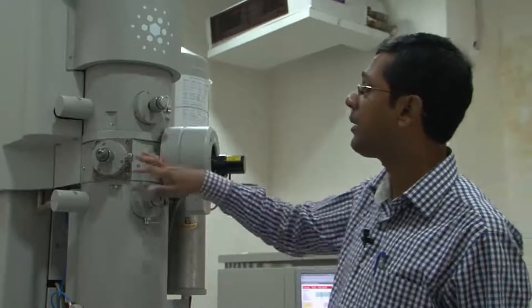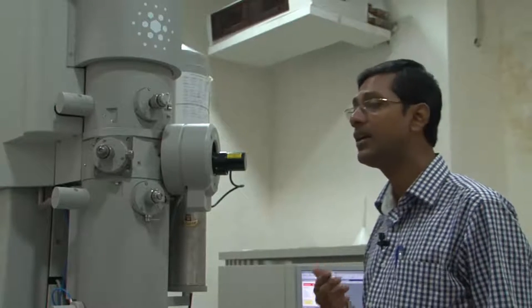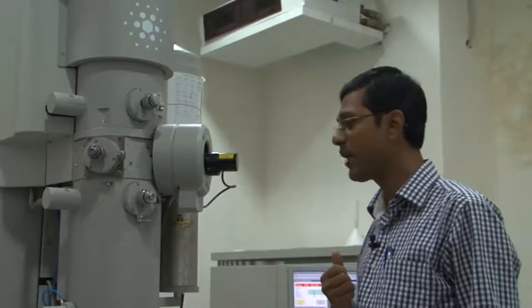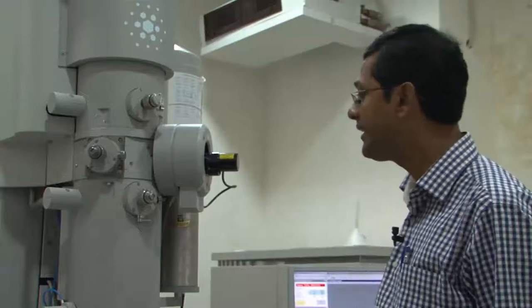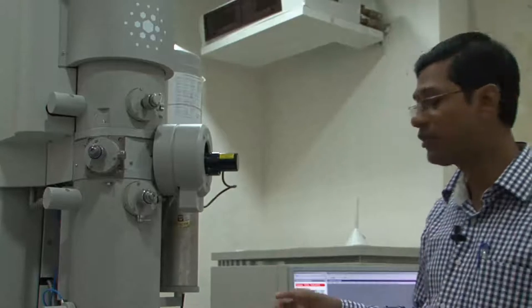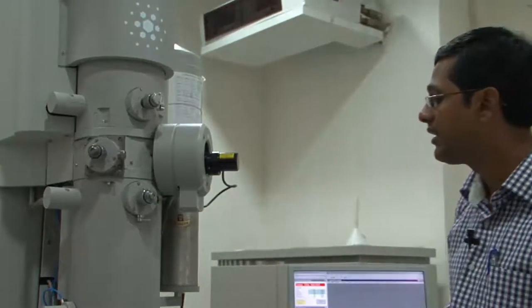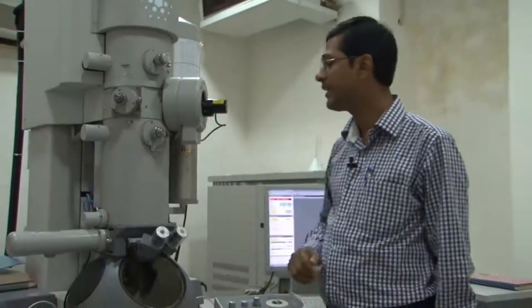Then you have an aperture in the objective lens column, which allows us to select whether we want to image using the transmitted beam, or we want to image using a diffracted beam, or you want to do high resolution electron microscopy, which I will show within a few minutes. Then you also have an aperture for SAD, or selected area diffraction. Basically, if you want to select a particular region of the sample and do the diffraction analysis, you need to use this aperture. There are actually three or four apertures depending on the kind of investigation you would like to do. One can select these apertures and then get diffraction information.